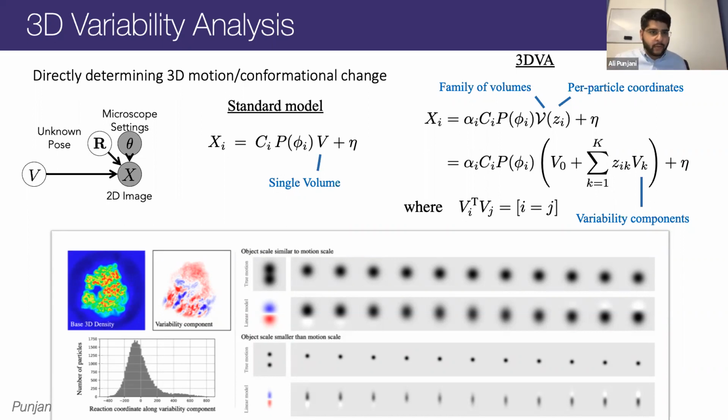You can always just solve more variability components until you start to find that they are no longer capturing significant motion or variability or anything that you can interpret. Obviously, there's a limit in terms of the signal to noise ratio in the data and how many variability components you can actually get, but you won't lose the first few if you just ask for more.